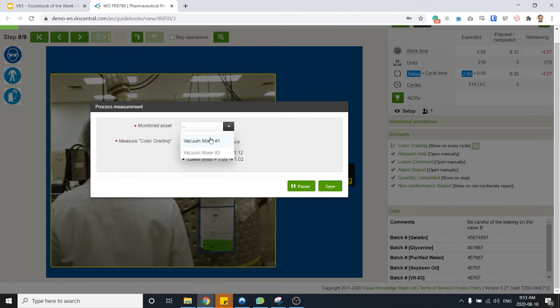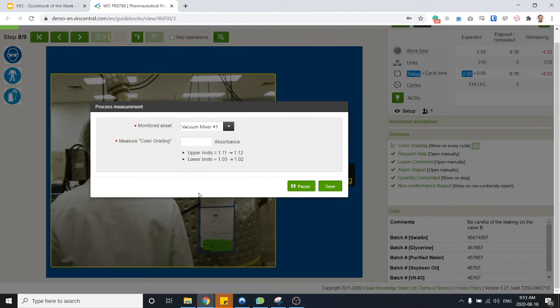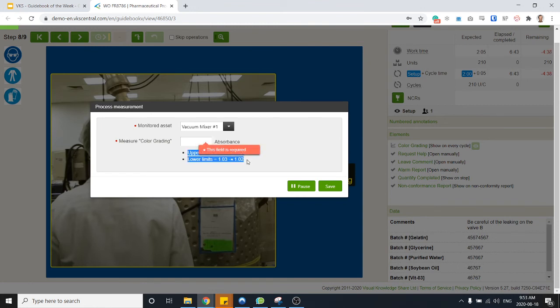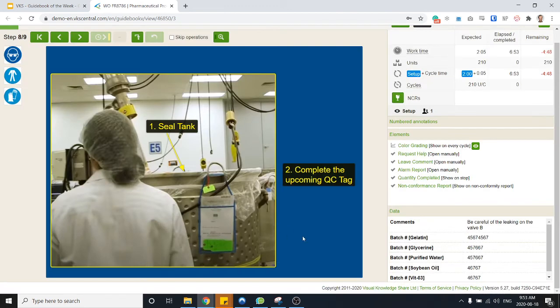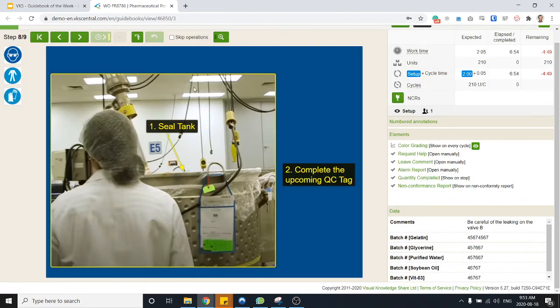Asking me to pick the equipment with which I'm working on. So in this case, volume vacuum mixer number one. And then I can enter a value, and if I enter something that is out of this range VKS will automatically send an alert to the right people. In my case let's say the measurement is fine, 1.05. I can hit save and whatever I've entered will be logged in my report.